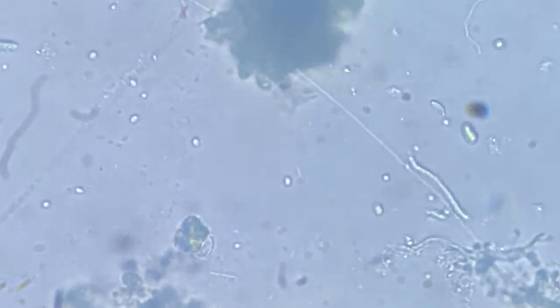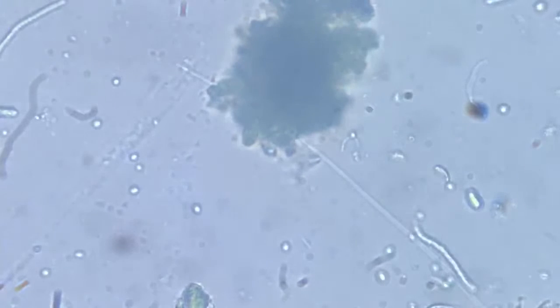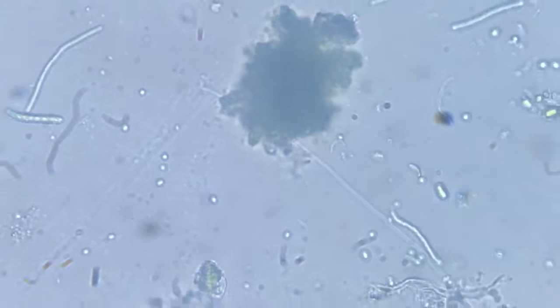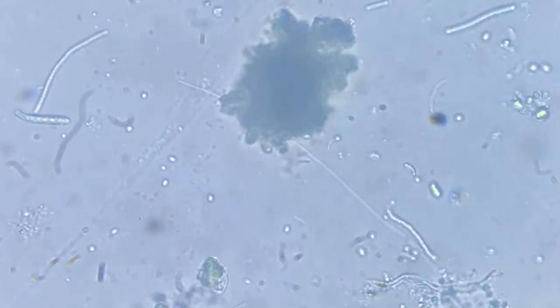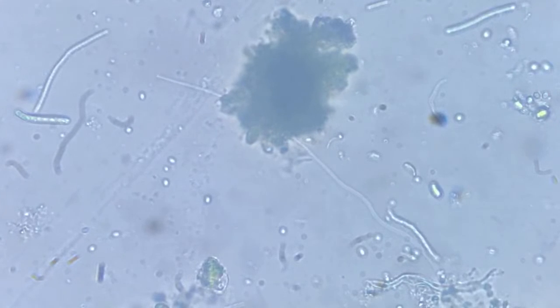Now, as it is going, it's pulling this debris as well. So they are pretty stout, strong. You can see that big bunch of debris is being pulled. These are pretty strong animals.